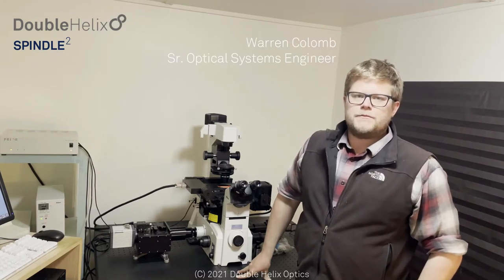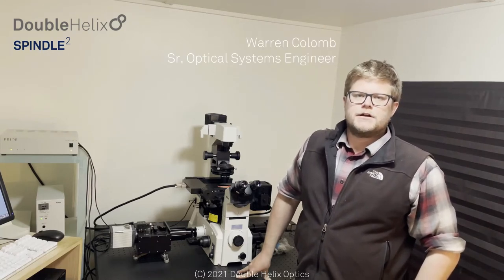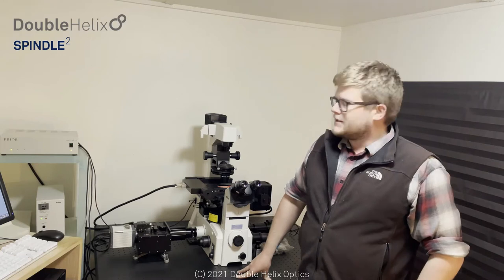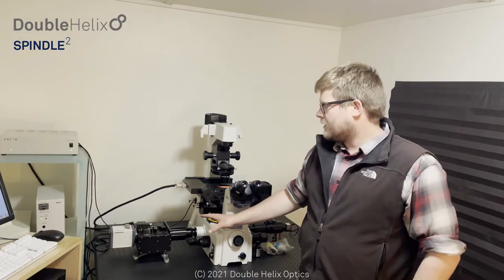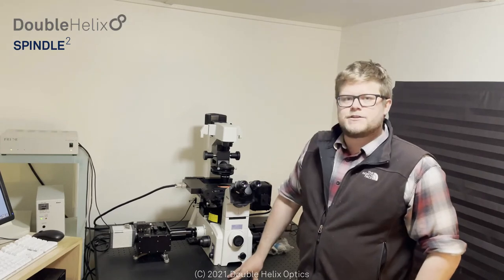Hi, my name is Warren Coulomb. I'm the optical systems engineer here at Double Helix Optics, and today I'll be walking you through our new Spindle Squared multi-color engineered PSF imaging system.